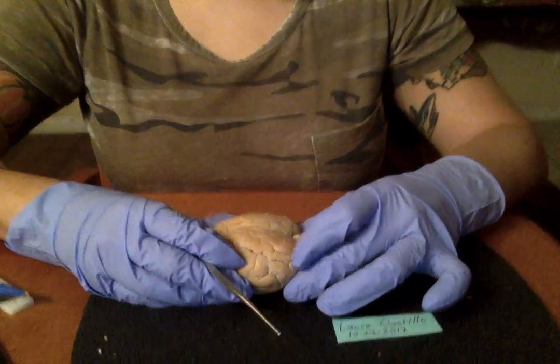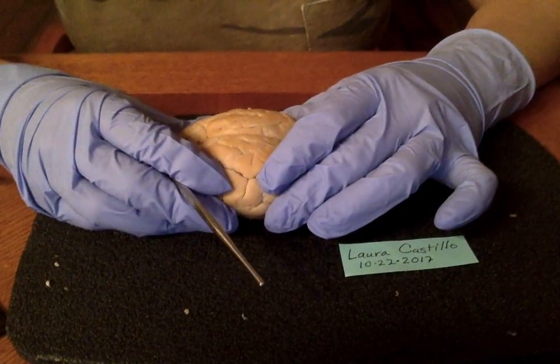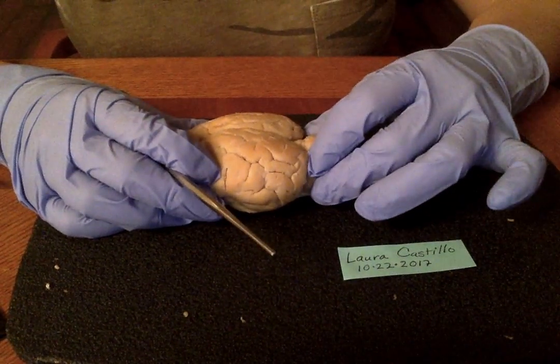The date is Sunday, October 22nd, and I'm going to be going over the parts of the brain and the gross anatomy of the central nervous system. So let's angle the camera. There we go. So here we have the sheep brain.